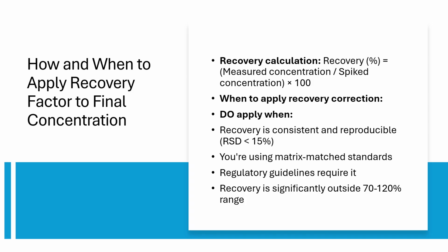After you analyze the batch and you find out the spiked sample recovery, as per SANTE guidelines, if the recovery is in the range of 70 to 120%, then there is no need of applying recovery factor.